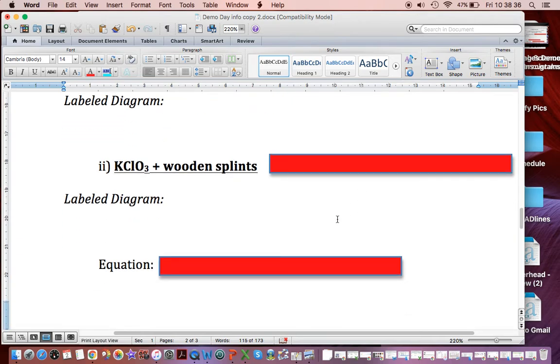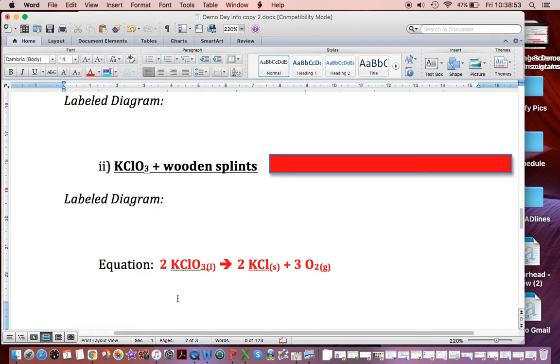And the equation I'm going to give you is just for the KClO3 generating the oxygen. In fact, I'm not really worrying so much about the burning. So first the oxygen gets supplied, and then the wood actually catches on fire. Here's our equation. So there's the 2KClO3 liquid, because I'd melted it, became 2KCl solid, and the oxygen. And this is an oxidizing agent, produced oxygen in this case, which supported the burning of the wood.